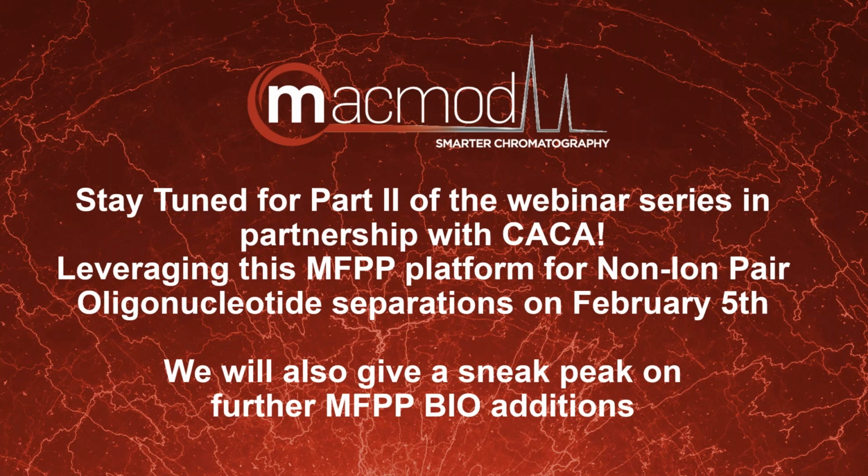You would pick probably a 3 millimeter column to save solvent, or 2.1 if you have LCMS capabilities. And obviously if you had MS, that gives you the full range, where you're not only working on retention times and UV spectra, but also seeing mass data. That's what we would suggest, unless we knew something specific about the analyte. If we knew it was some specific chemical entity and had some familiarity with it, we might point you in a different direction. But not knowing anything about your sample, that would be the best way to go forward.